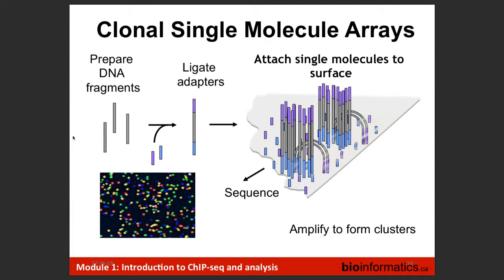Yeah? Is that because of the conformation of the DNA, somehow they're able to go into the areas? Yeah, I mean, I could hypothesize. It's reaching into different areas. Why that might be, I don't know. But it probably has something to do with the density or availability of that region to be either sheared or digested with MNase. But it is important to keep in mind.